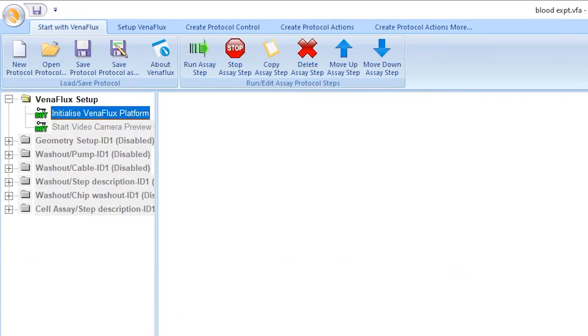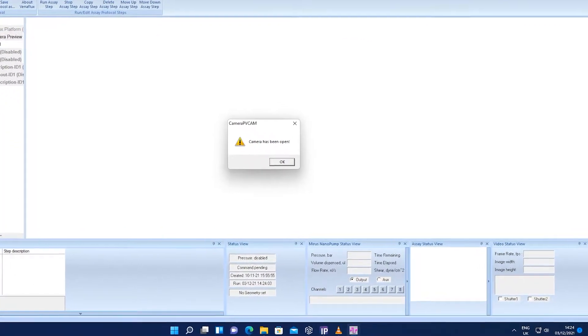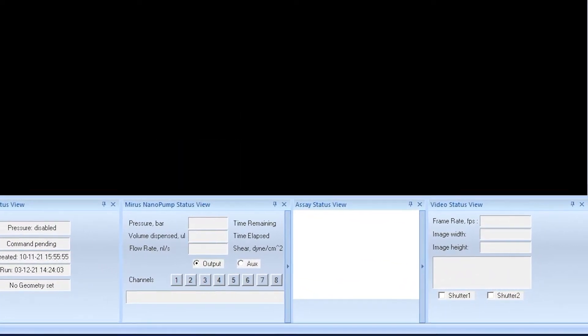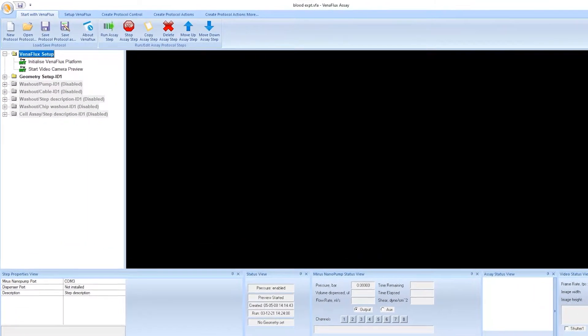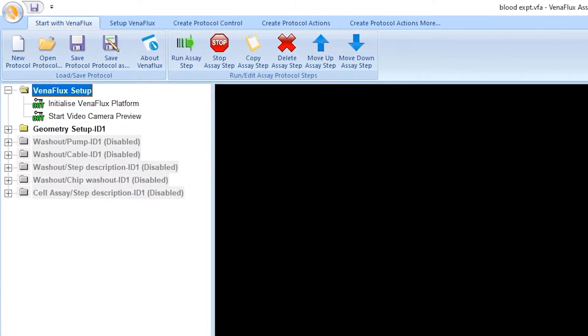Click Venaflux setup. Right click to select Run assay step, or click Run assay step with the green arrow from the menu. The geometry setup is important as the internal dimensions of the channels of your biochip affect the shear stress or shear rate of the experiment. Click Geometry setup.